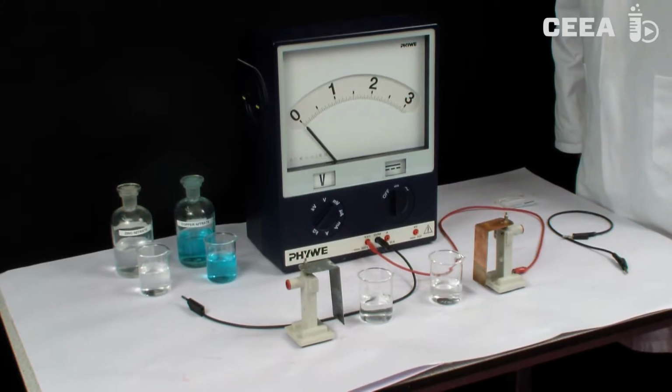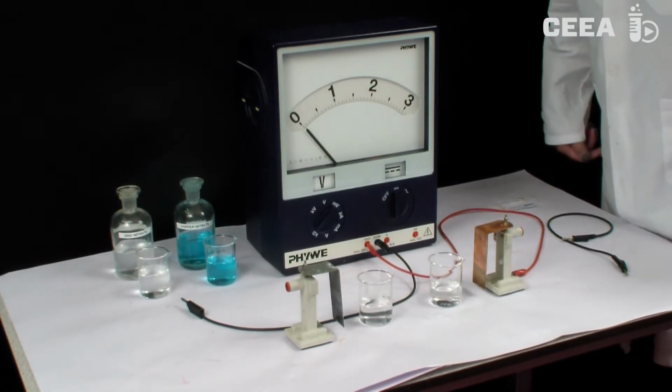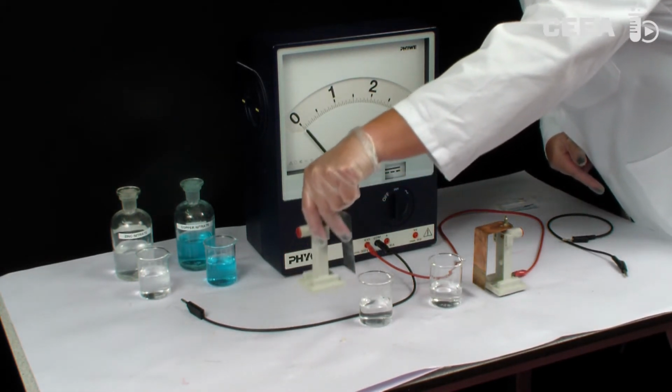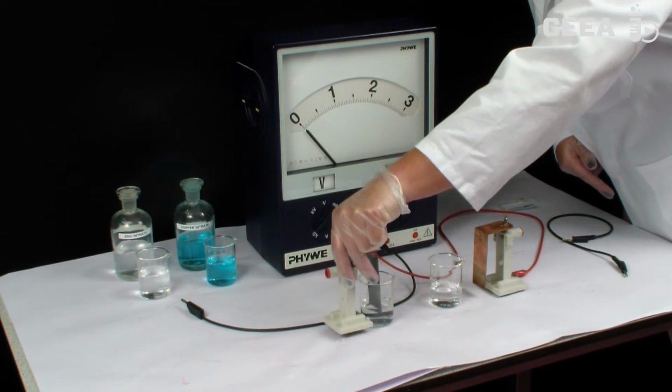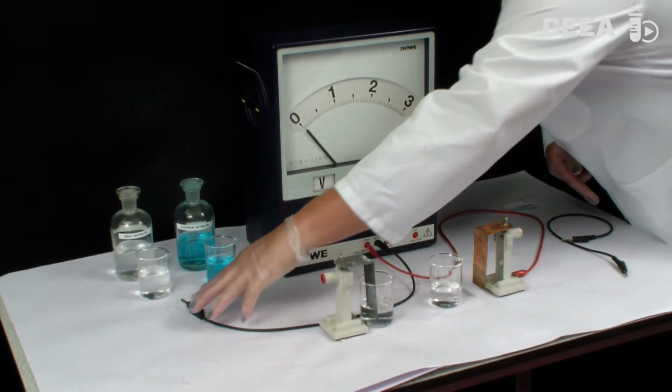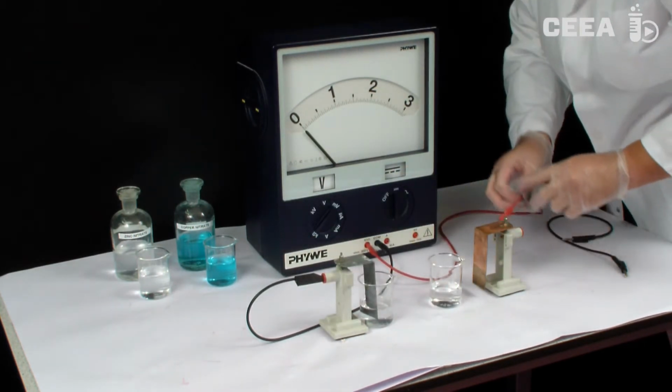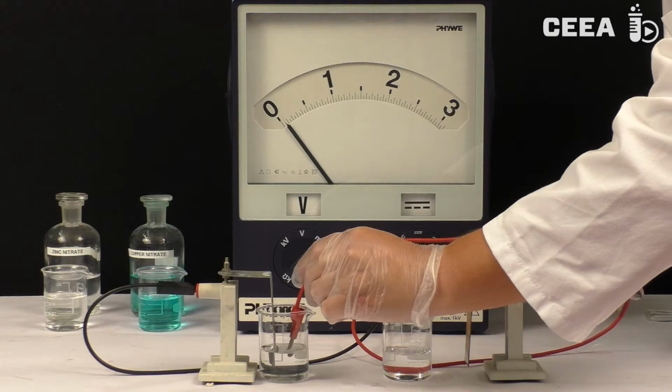To start with, we show you what happens when a zinc plate is placed in water and the voltmeter is connected to both the zinc plate and the water. We notice a potential difference between the zinc and the water, the zinc plate being negative and the water being positive.